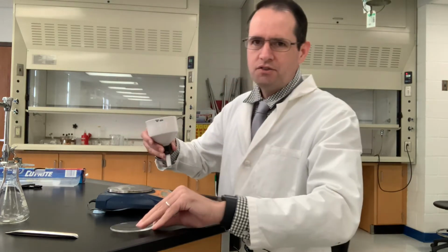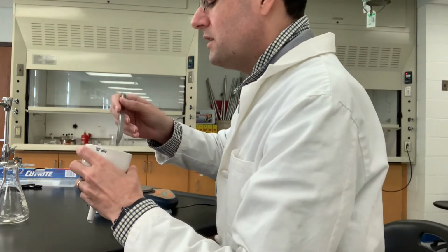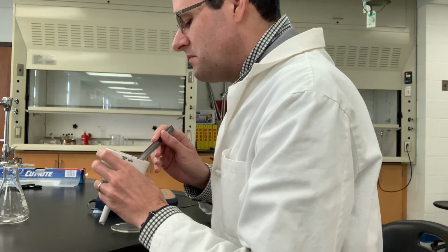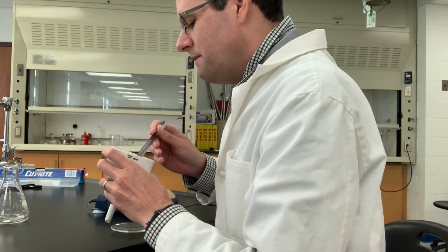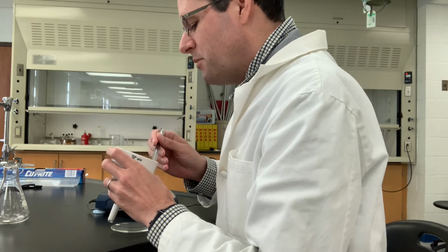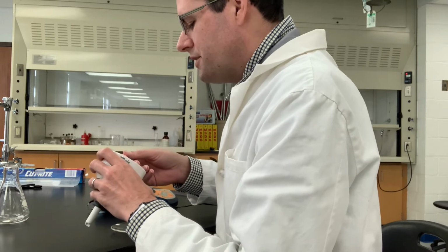And so now I'll just transfer the product onto this watch glass, and that should be all we need to do for isolating this product today and weighing it so we can calculate a percent yield. I'm trying to scrape the powder off of the magnetic stir bar here.